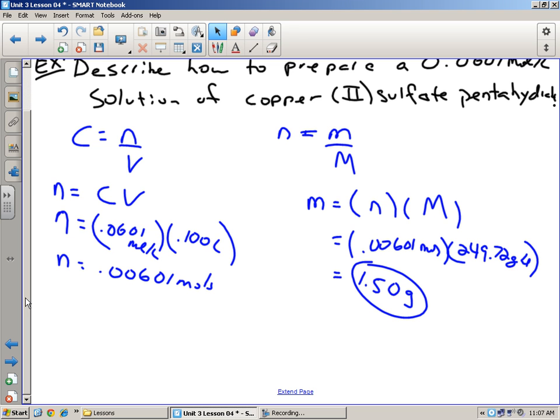and you have no way of knowing, if you go over, unfortunately, you probably have to throw it out. Okay, so you would actually have to take this and come see me, and I'll probably put it in the bucket, or if it's okay to go in the garbage, we'll throw it in the garbage. Because before you start this, of course, everything should be clean, but I can't take the risk that it's all clean and we can pour it just right back in there.